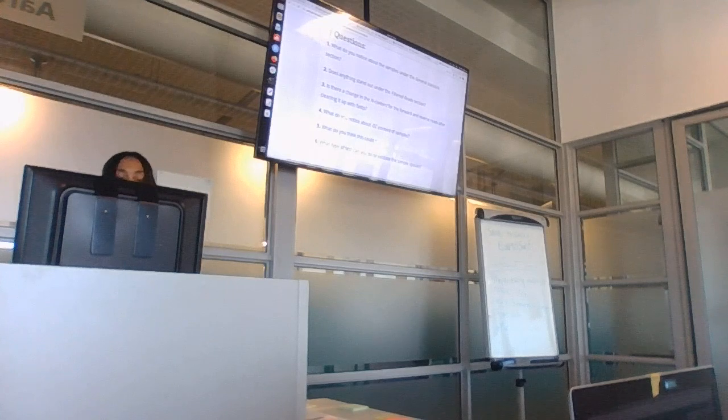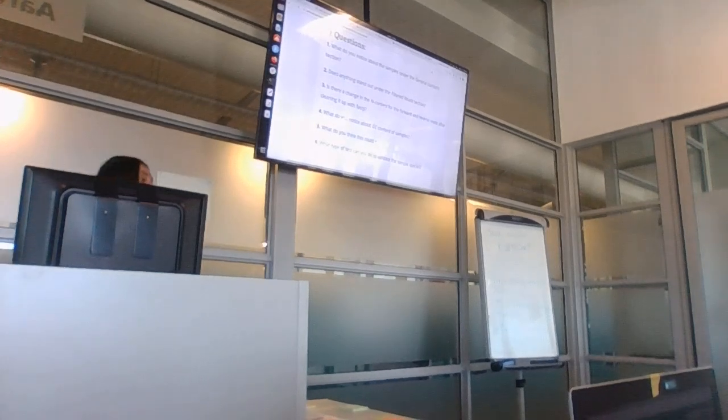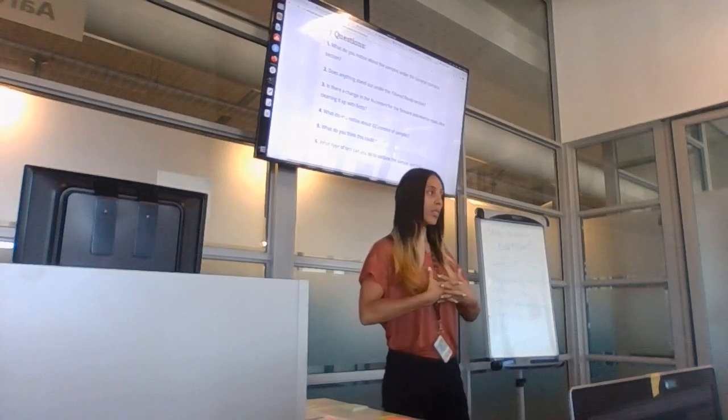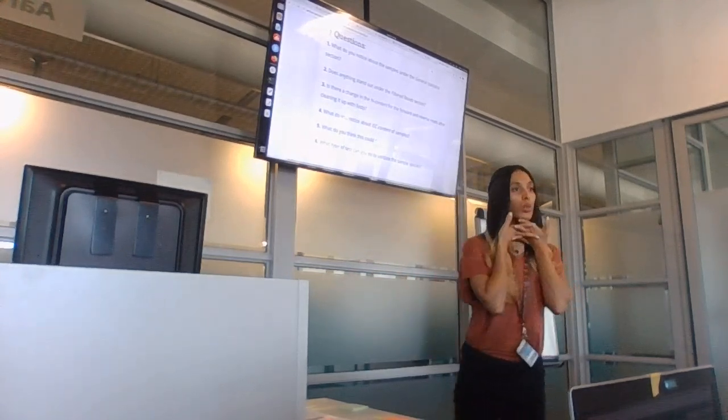Right, question 1. What do you notice about the samples under the general statistics? So we are now talking about your MultiQC report. If you look at your MultiQC report, what do you notice?